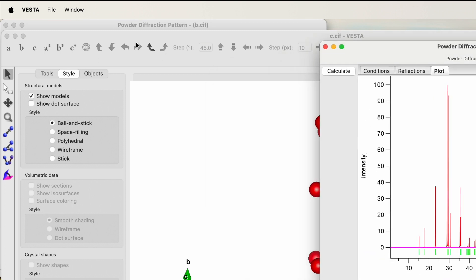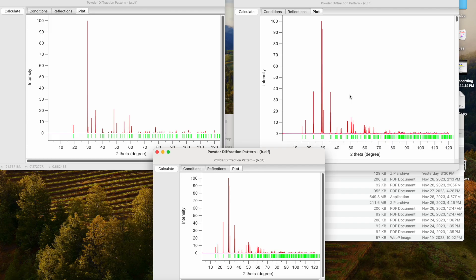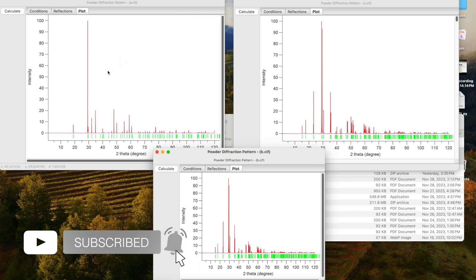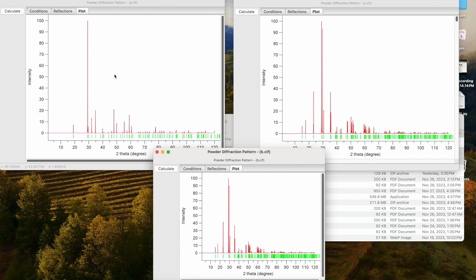So now we can compare these three plots with each other. Here the plots from B and C look pretty similar, but the plot from A is entirely different.